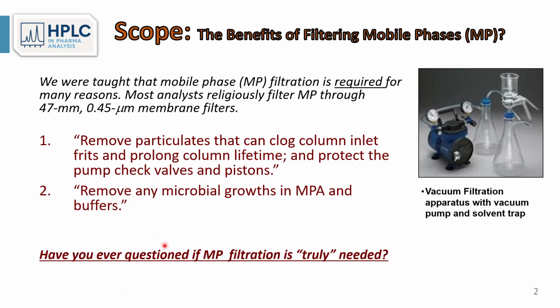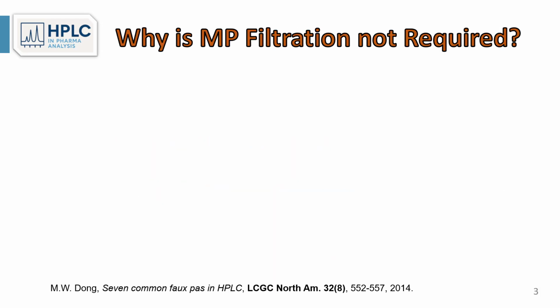Have you ever questioned if mobile phase filtration is really needed in a pharmaceutical laboratory that's running very smoothly? Here I'd like to do some counter argument on why mobile phase filtration is not required. Let's explore the reasons step by step.